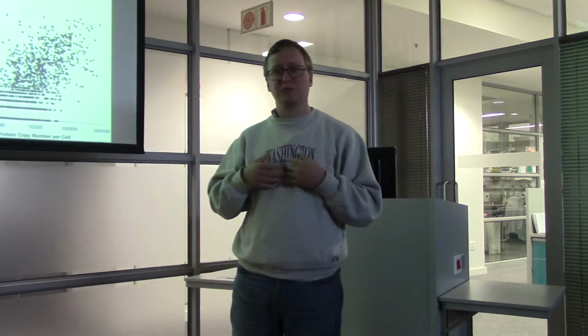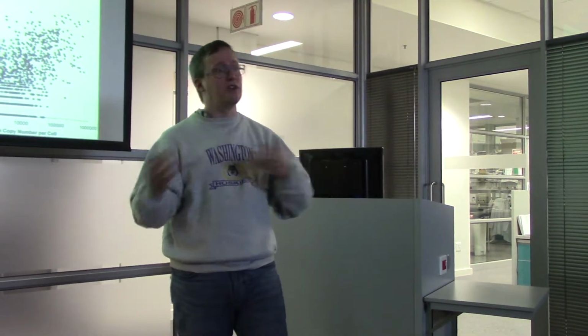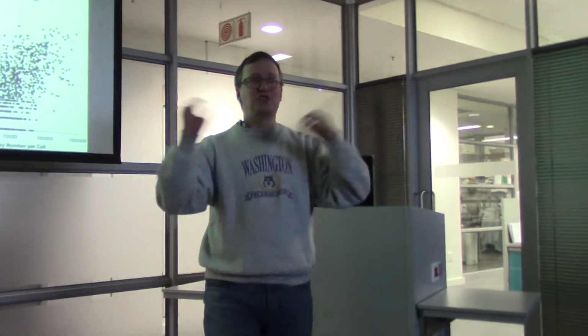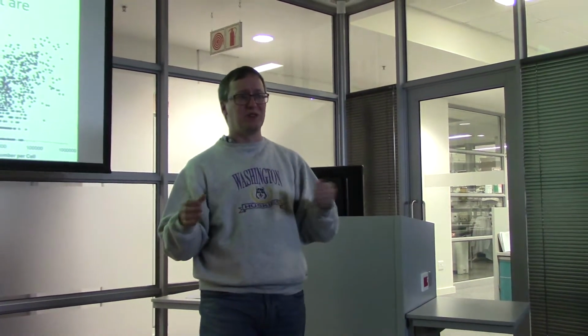In spectral counting proteomics, we see that the number of peptides that we observe from a protein will change as a function of concentration. So this protein may have 10 peptides in evidence in the first cohort and 20 peptides in evidence in the second cohort. So it's not just a question of multiple spectra for the same set of peptides, it's rather a different set of peptides being observed every time.